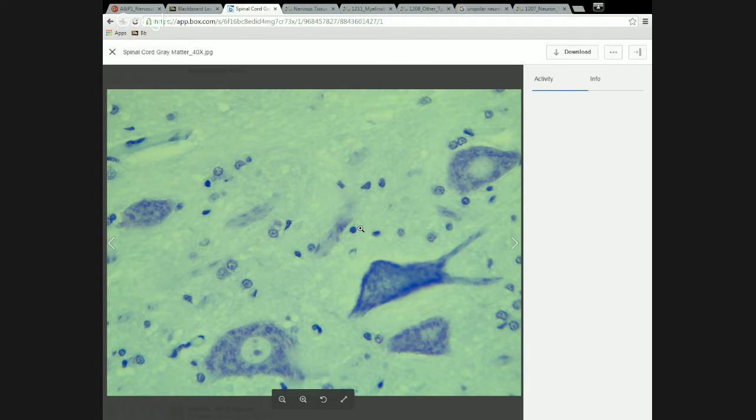I can't even tell you for certain that that's a glial cell. But assuming it is a glial cell because the nucleus looks different from the neurons that we've been talking about, in this part of the nervous system, gray matter of the central nervous system, the best bet is that it's an astrocyte. It could be an oligodendrocyte, but those are more likely going to be in the white matter. It could be a microglia, but I doubt it because of 2 reasons. One, microglia are very small relative to the other cells, so that's a pretty good sized nucleus, so I would expect that's not a microglia.